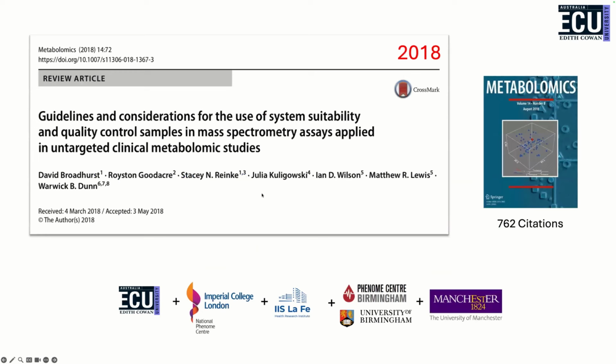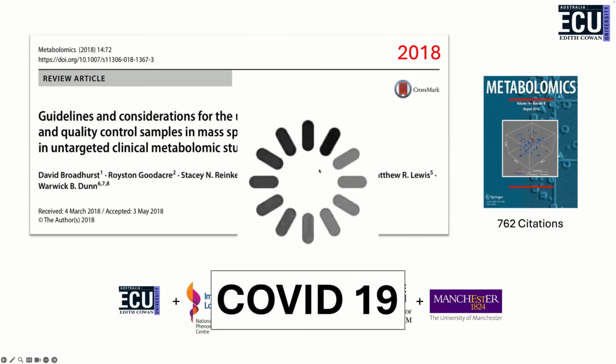And as I said at the start of the talk, this ended up a year later in this paper, which has gone down quite well. And then yet again, things paused in terms of the development of this software any further. I was doing a lot of projects in the background, and then of course COVID-19 hit. COVID-19 was the catalyst for me to think about developing this into a standalone app that people could use, and it wasn't just me doing service work for other people.